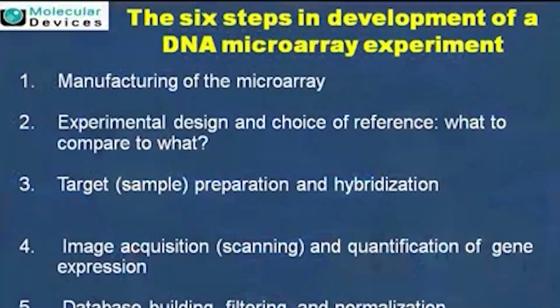I think it will be useful if you can first give some steps for the DNA microarray experiments. This is a proteomics course, and I have been talking more about protein microarrays, but this whole technology got initiated from DNA microarrays. So that students have some idea about how DNA microarrays are performed, just give some brief steps about the overall DNA microarray technology, and also how and what GenePix can help in the microarray process.